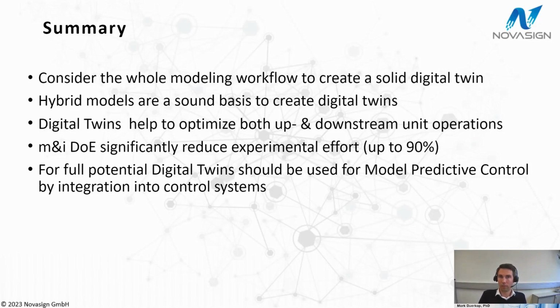So it's really about everything. The experiments are as important as the modeling approach. The hybrid models themselves are a very sound basis to build such a digital twin. They can learn on only a little amount of data, so that's really cool. And the digital twin then can help you to optimize up and downstream.